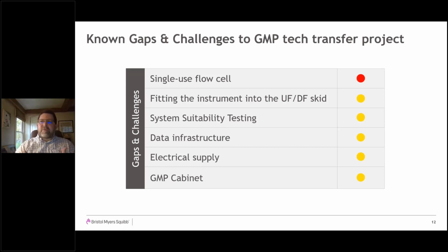However, like I said, we know they exist, we've tested them, and so at some point, I assume that the kinks will be worked out, and they'll be able to certify these are fit to be CFR compliant.